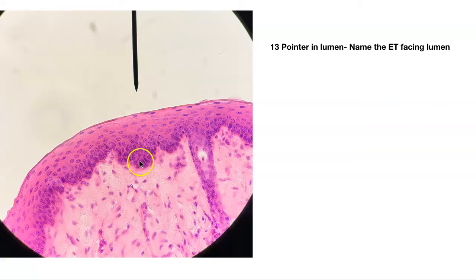Number thirteen — the basement membrane is somewhere down here, this is connective tissue. Here's your epithelial tissue. It's stratified — more than one layer thick. You look to the top: those cells have flat, flattened nuclei. This is stratified squamous non-keratinized. You have to specify keratinized or non-keratinized. Non-keratinized — these cells are still alive up here.